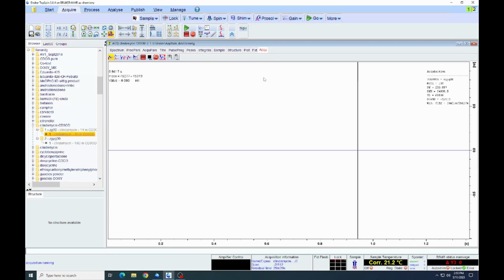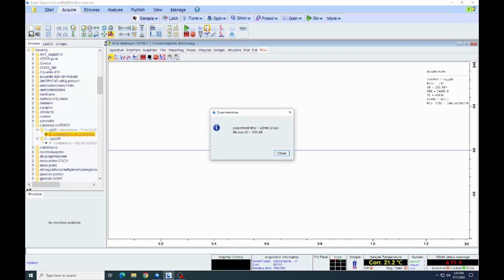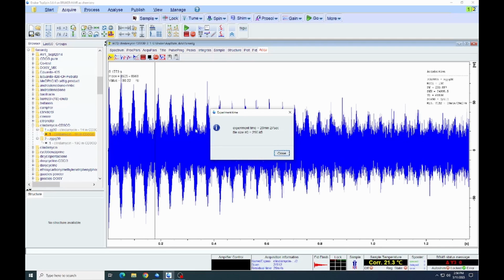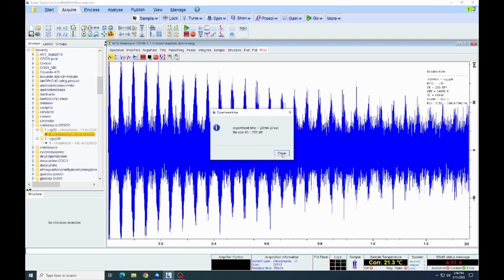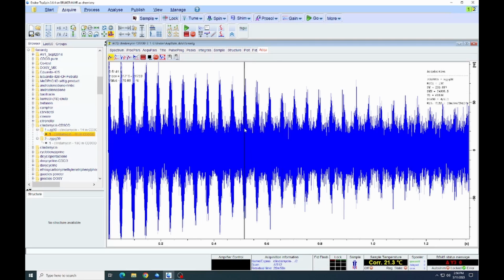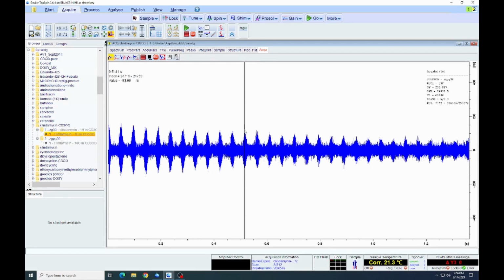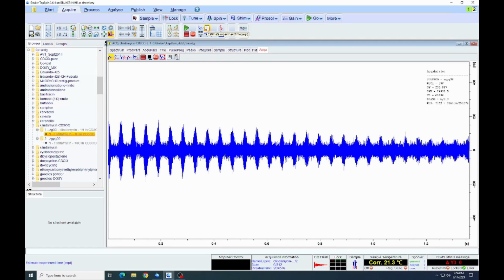We see here it's going to do 512 scans. If we click on this clock icon up here, it will tell us the estimated time for the experiment. And you can check this, it's about a half hour. You can check this when you're setting up the experiment as well. But if you look down in the bottom where it says acquisition information, it tells us we've got so far 4 of the 512 scans. And it also gives us a residual time. So at this point, we know how long we have until the experiment is done collecting.